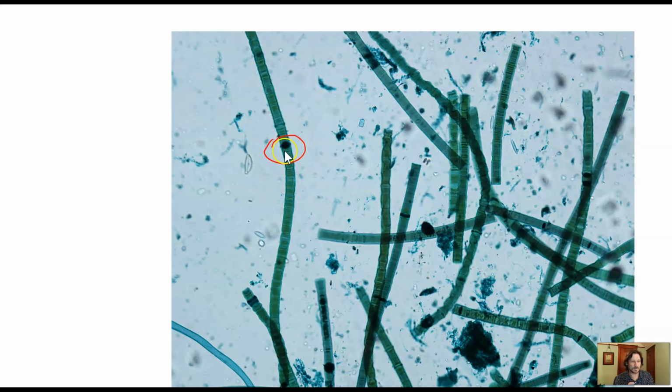Here, what we see is actually growing in the organism, and that is a breaking point. It will actually break off. And if you look at the ends of this one, you can see how the tips are kind of cup-shaped. And that's because that's what's happening there. It's making a little cup, a little air bubble as they die off. And you see another one forming down here. So that's what's going on in that slide.